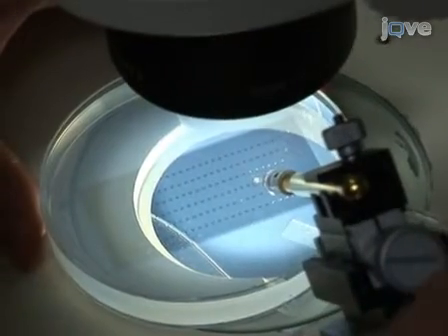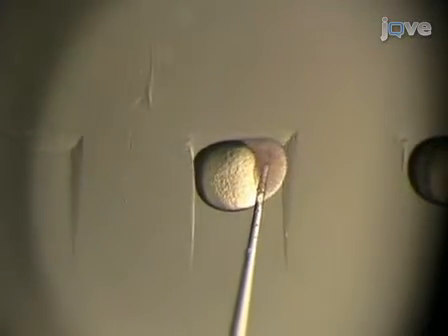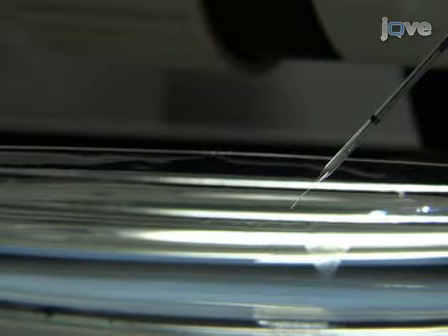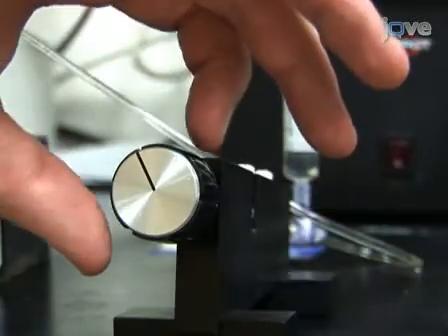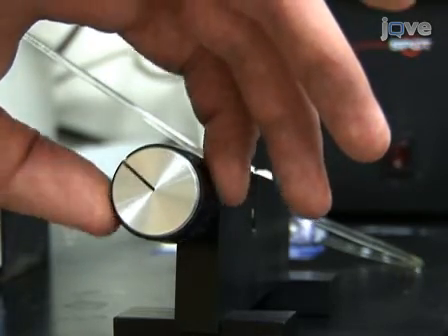Position the dish on the stage so that when the transplantation needle enters an embryo, the needle pushes the embryo against the back wall of its well. Using the micromanipulator, lower the transplantation needle into the dish at a fairly steep angle. Ideally, the transplantation needle should enter the embryo at approximately a 45-degree angle. Once the tip of the needle is below the surface of the embryo medium, draw a small amount of embryo medium into the needle by twisting the micrometer drive controlling the Hamilton syringe.